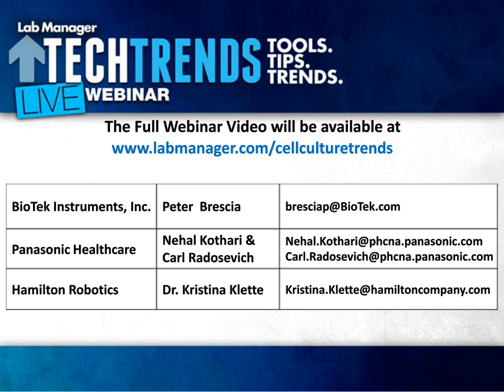But if you do have contamination and it's been confirmed, you really need to take a good look inside your incubator. If your incubator does have a decontamination system built within it, I would run that. Do your hydrogen peroxide / UV cycle, or run your high heat decontamination just to eliminate it. Because these contaminants are living organisms just like your cell cultures, and they love the warm, dark, and humid environment within your incubator.